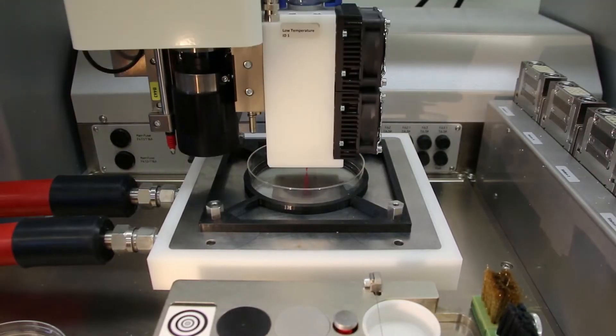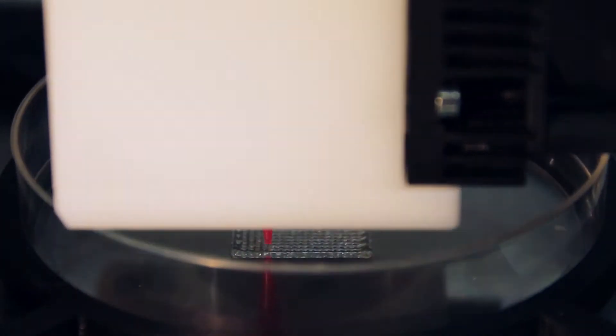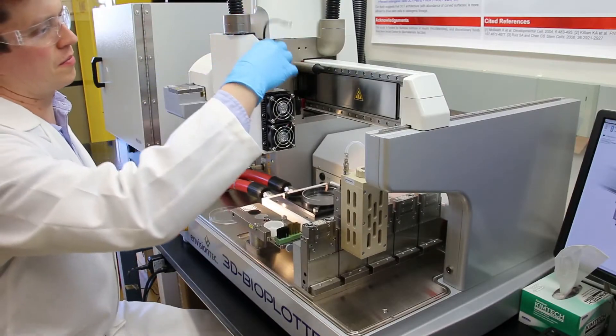The ultimate goal of 3D bioprinting is to be able to print functional organs on demand. So the bioplotter for us is a tool to help us do our research.